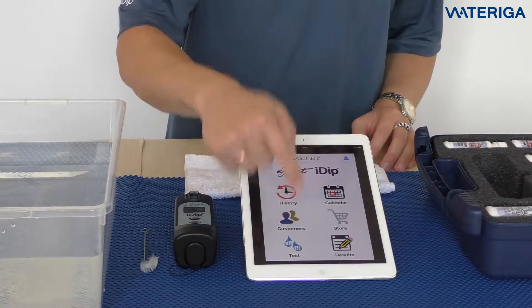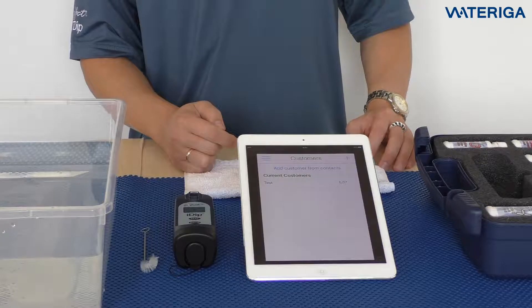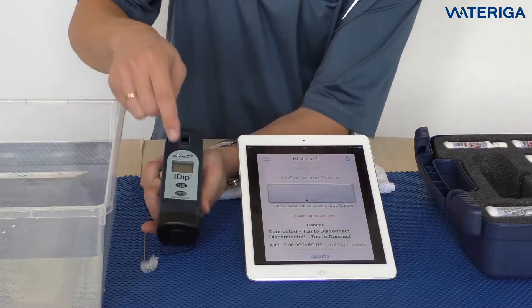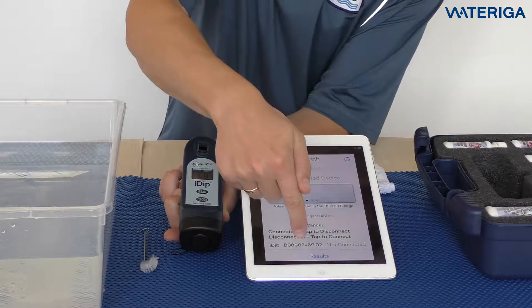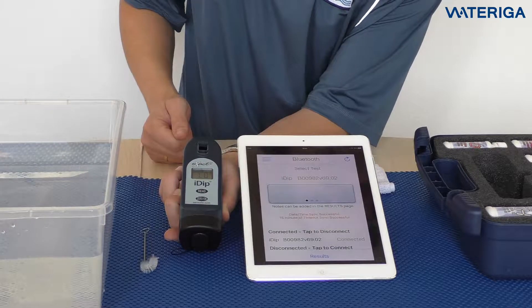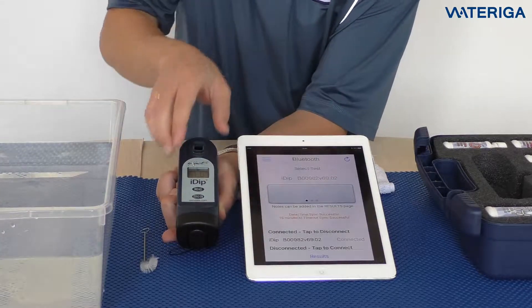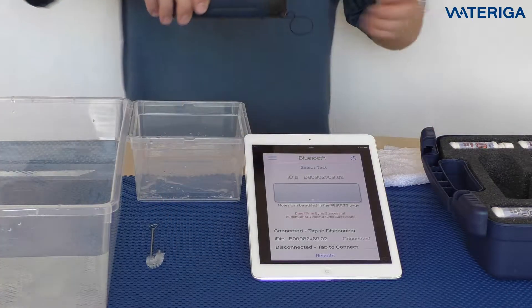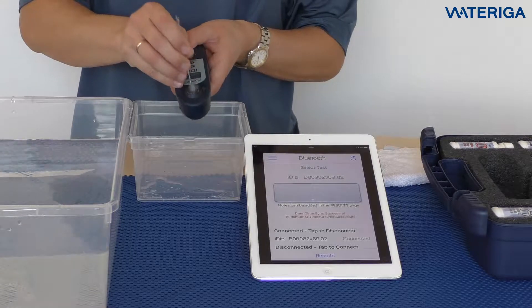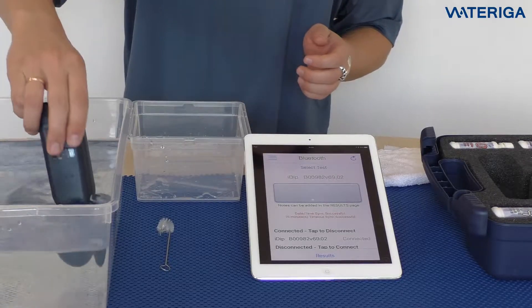First, select the customer — we've already created the customer called Test, so we select that. Then select the menu and proceed to Bluetooth Test. Get the i-Dip and turn it on, then tap to connect it. You can see our 15-minute timeout timer, and the synchronization has been successful. The Bluetooth symbol in the corner confirms the i-Dip is connected. Then take the i-Dip and the brush, get some water in the cell, and brush it out to make sure it's clean. Rinse the cell three times with the water you will be testing with, then fill it up to the top.